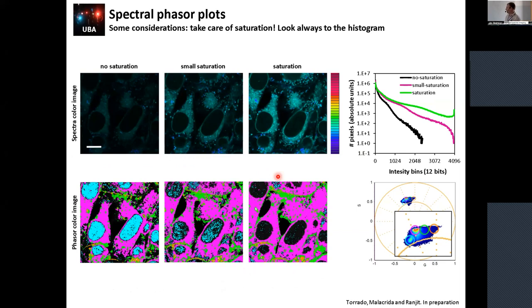And here I just did an acquisition to show that you can do the transformation, and I put a cursor here to see how the coloring in the image changed. This is not saturated, and as soon as I begin to saturate, you see that the pixels are moving from where they were before in the image, and then you start to highlight different regions. So saturation is an important issue for hyperspectral imaging.